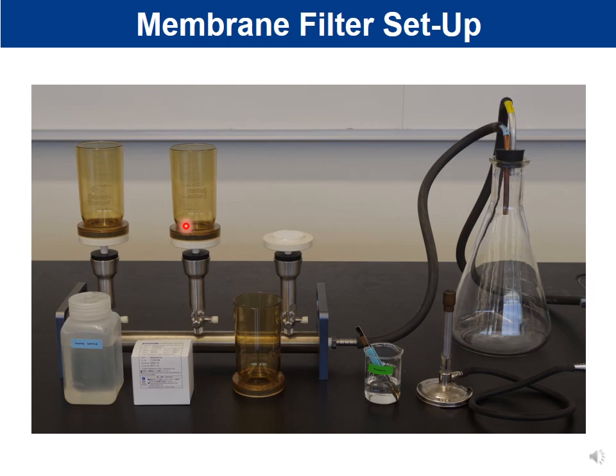Now, the flask itself, again, we're not testing the water that's in the flask. We're going to be testing for bacteria in the water by looking at the nitrocellulose and basically what bacteria got trapped on the nitrocellulose. We also would have out a beaker of alcohol, and there would be forceps in the alcohol. We would have our Bunsen burners.